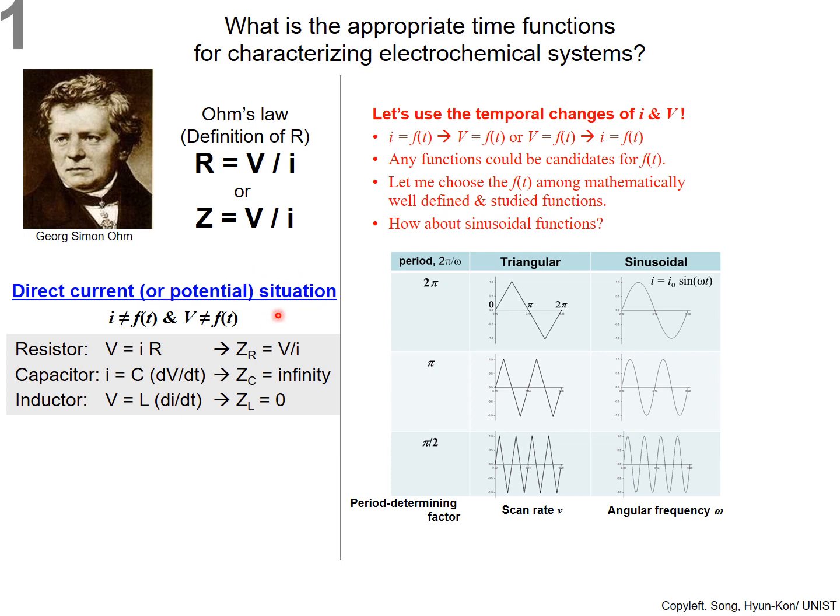We'd like to get some more information from our electrochemical processes when we are trying to analyze them. So let me change the functions of current and voltage.